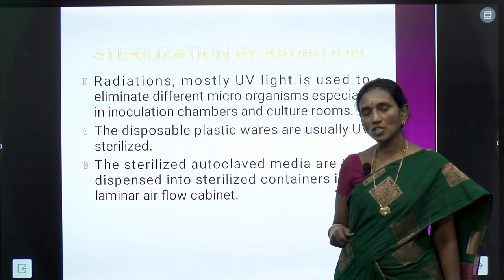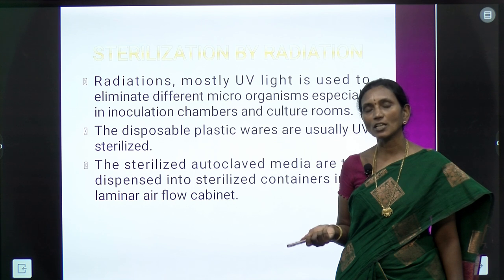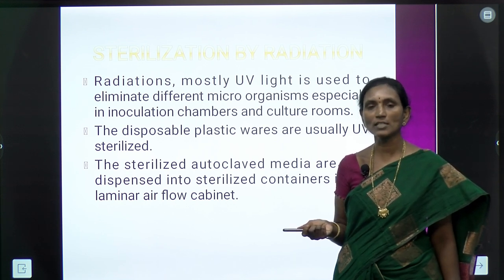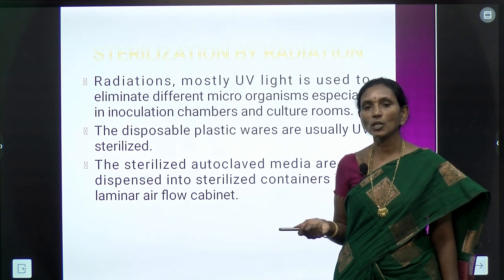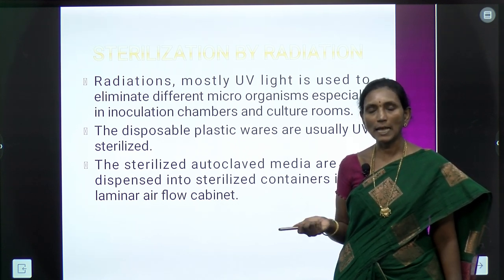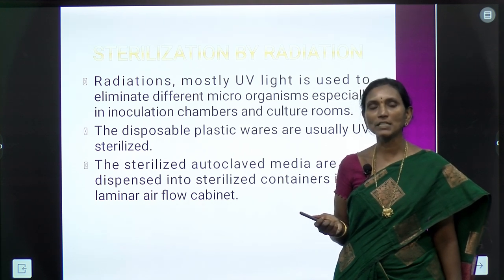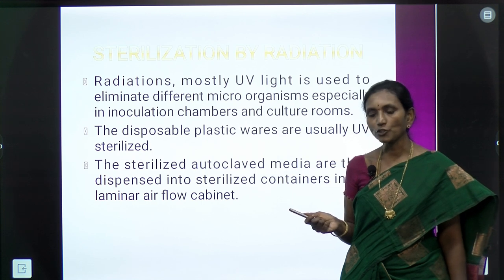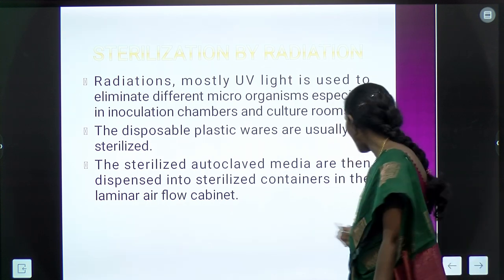This must also be done under aseptic or sterilized conditions. So, laminar airflow chamber is used for this purpose. In laminar airflow chamber, complete aseptic environment is provided through UV lamps, etc.